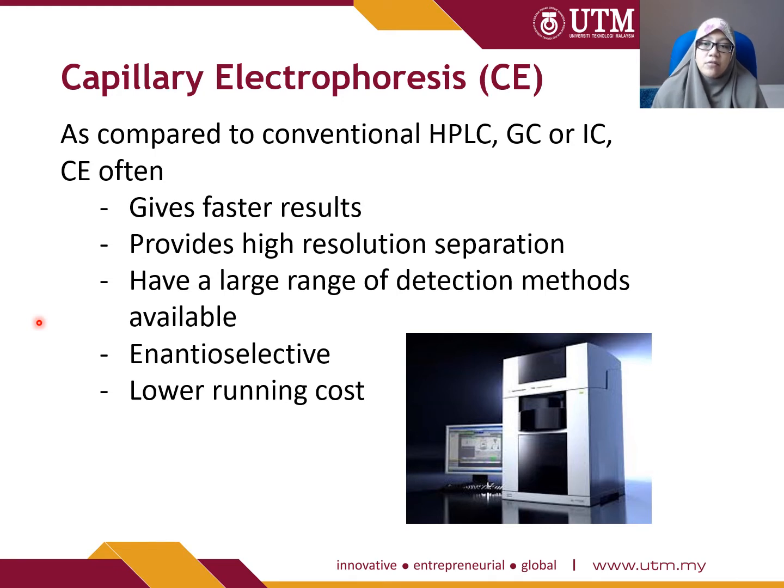Okay, another one, it is especially preferred by people to do separation because it can run at very low cost. First, sebab dia punya distance ataupun capillary tu sangat kecil, so bila kecil dia boleh separate dengan mudah, dan bila mudah, cepat, so it melibatkan kos kan, kos masa, kos tenaga, kos the electric itself.